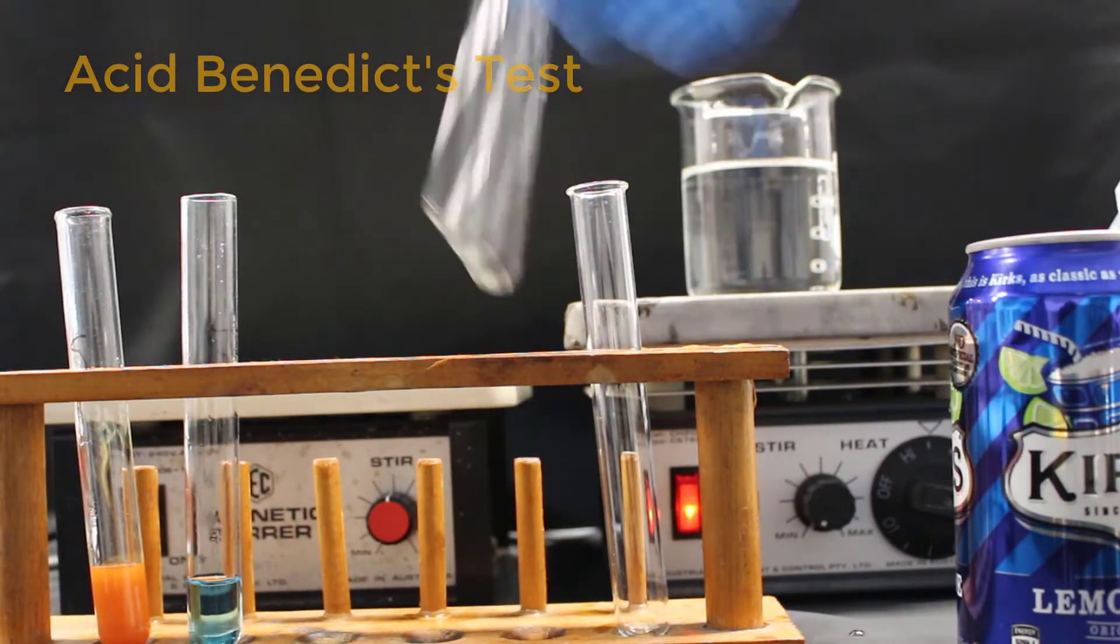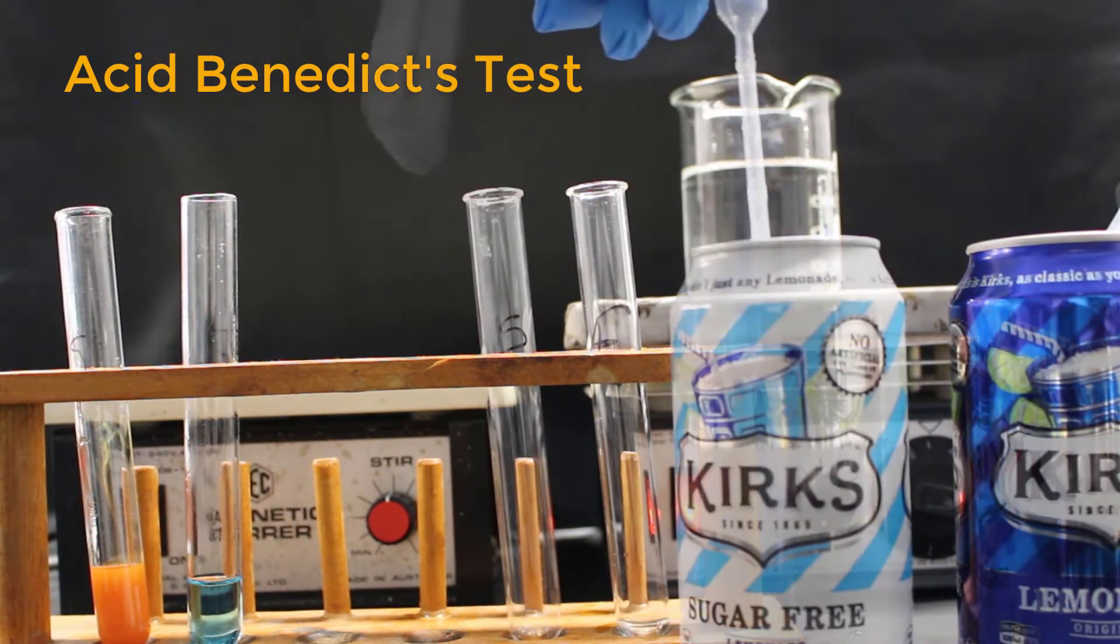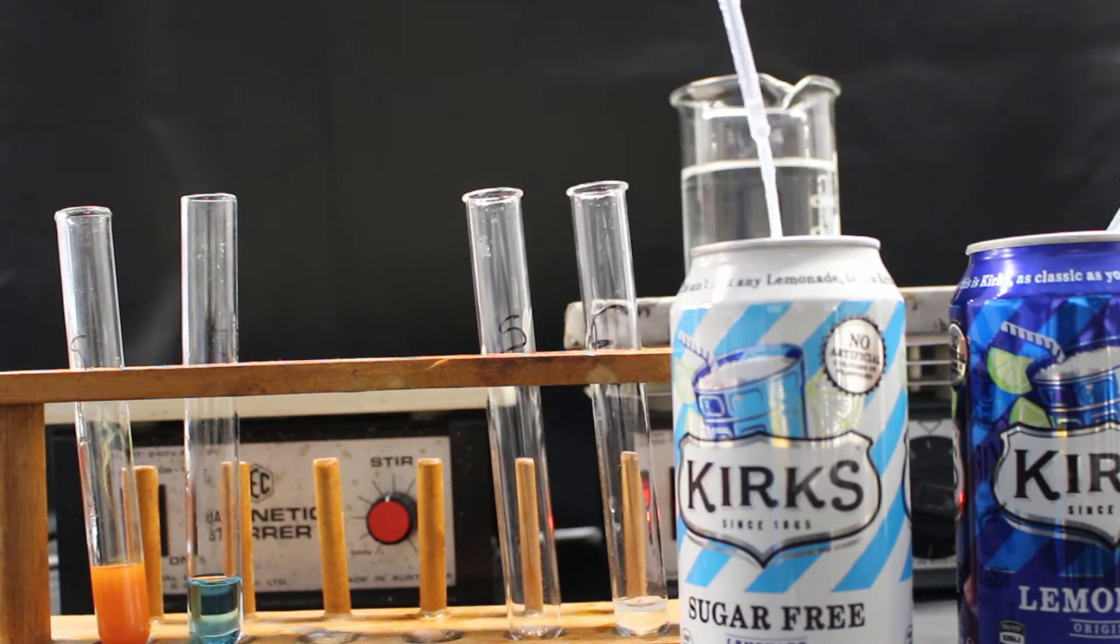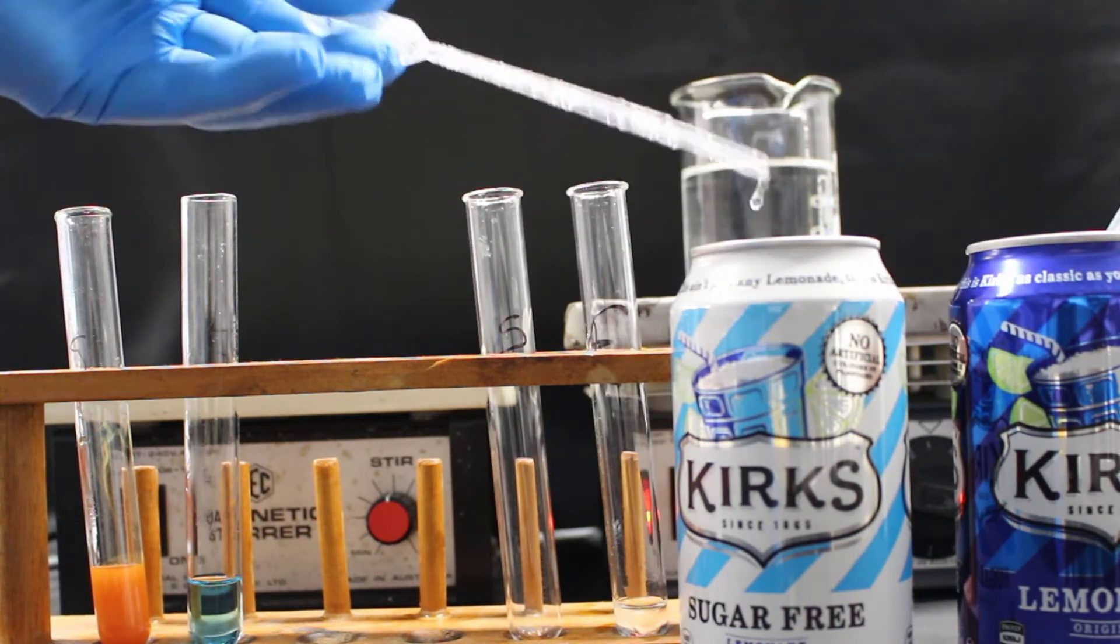The second test is Acid Benedict's Test. And it's a test for a different type of sugar called sucrose. Sucrose is table sugar.